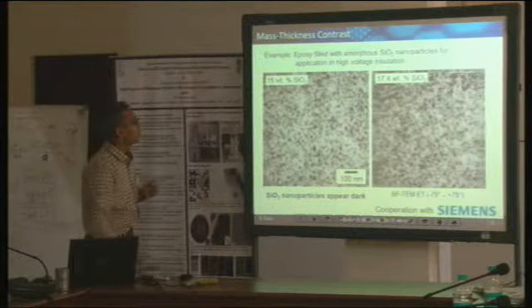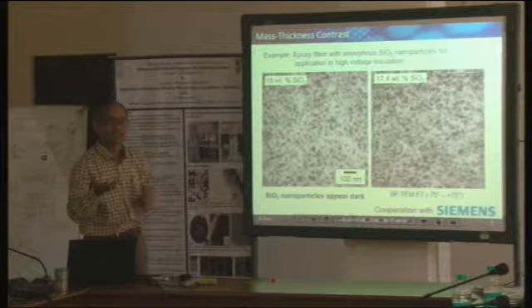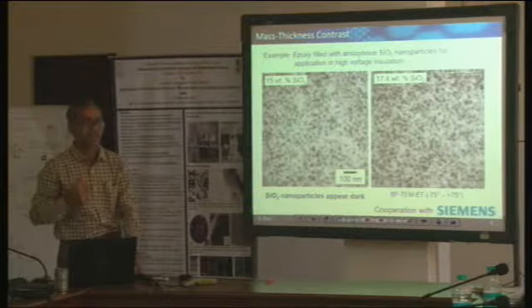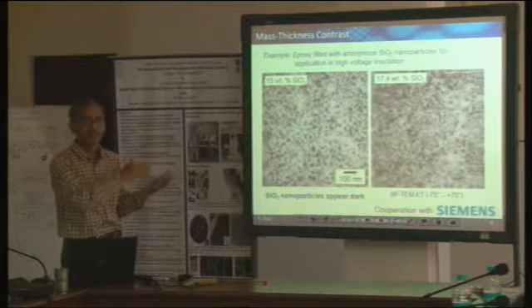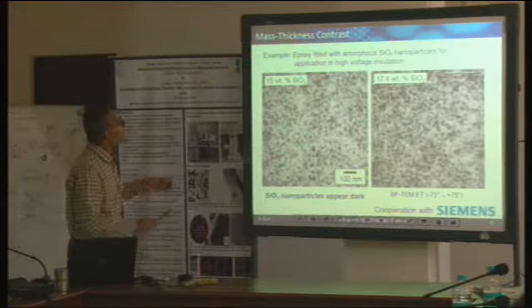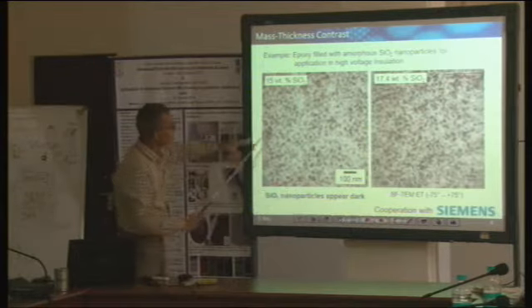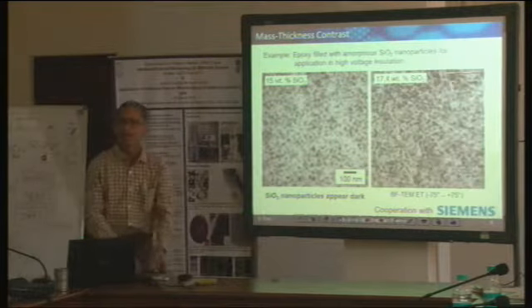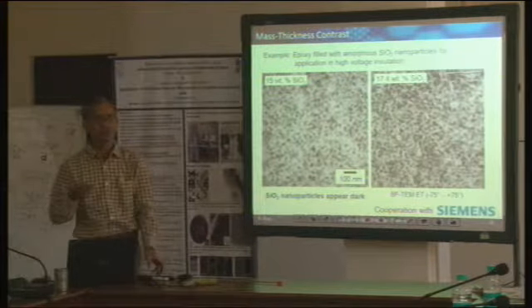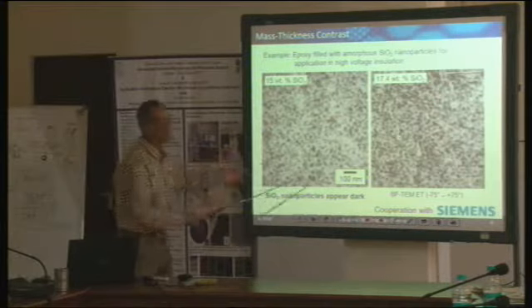Now see that epoxy is likely to be some organic material, so it is a light element material, correct? Whereas this silicon oxide is, relative to the matrix, heavy. So if we make one static image, we get a contrast like this. And you see here, normally a typical material scientist usually works with crystalline samples, and therefore he will never get an image like this.